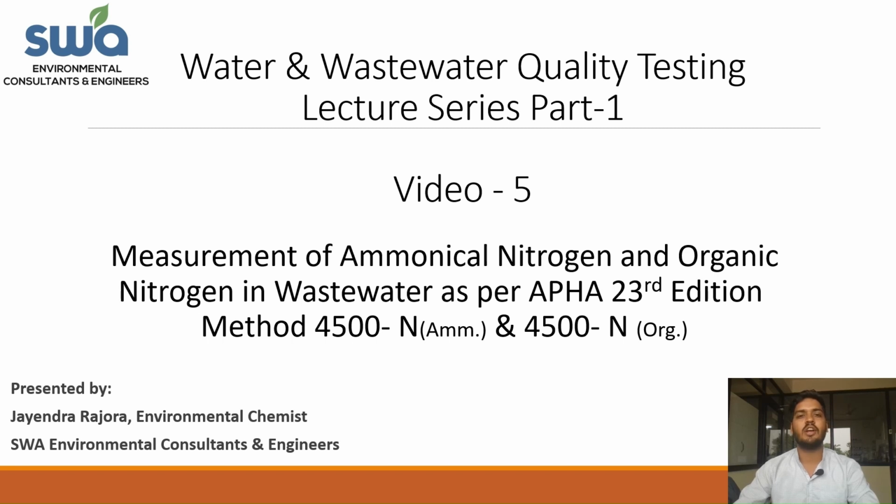This is the Water and Wastewater Quality Testing Lecture Series Part 1, and this is video number 5. In this video, we are going to learn about the measurement of ammonical nitrogen and organic nitrogen as per method 4500 of APHA 23rd edition, which is given for ammonical nitrogen as well as for organic nitrogen. So now let's start the video.